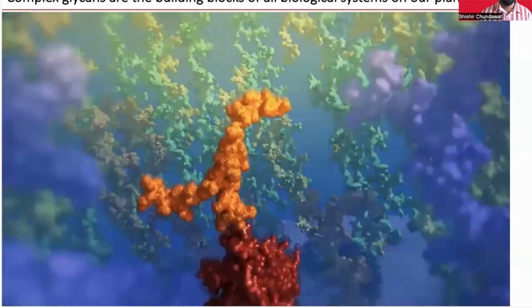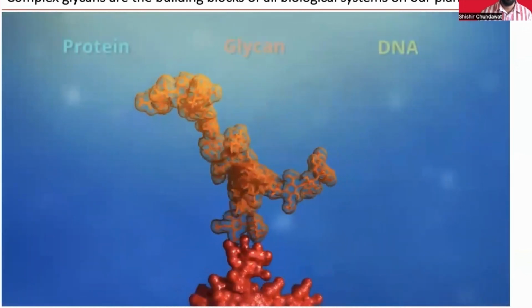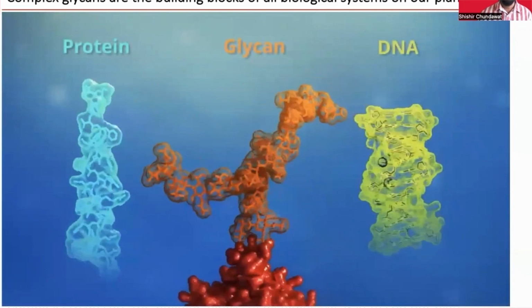So what you're seeing over here essentially is an N-linked glycan that's attached to proteins, structurally quite complex and play many different roles. From a biologics point of view, Áron will be talking to you about how we can monitor these to essentially control the glycosylation or N-linked glycosylation in particular, and how that impacts the manufacturing process and some of the tools that we've developed for monitoring N-linked glycosylation of proteins.